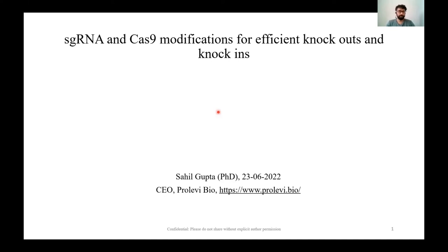Today I'll be talking about how to efficiently target your homologous construct in primary cells using genetic engineering with CRISPR-Cas9 technology. And this experience I mostly gained during my time in postdoc. And I would like to share this with you today.